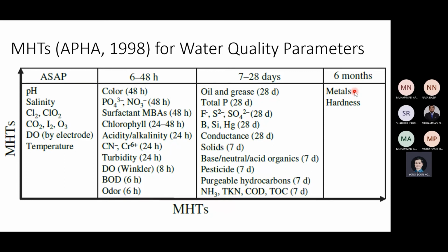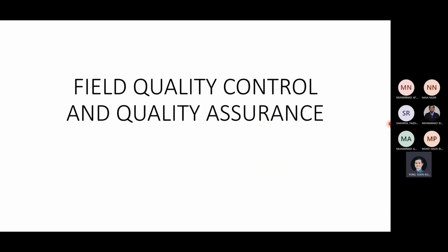But frankly speaking, this one is probably the easiest. Acidify straight away, you send to ICP, then you get the result straight away. Even faster than this one. The analysis from here. Yeah. So remember, yeah, these are the maximum holding times.